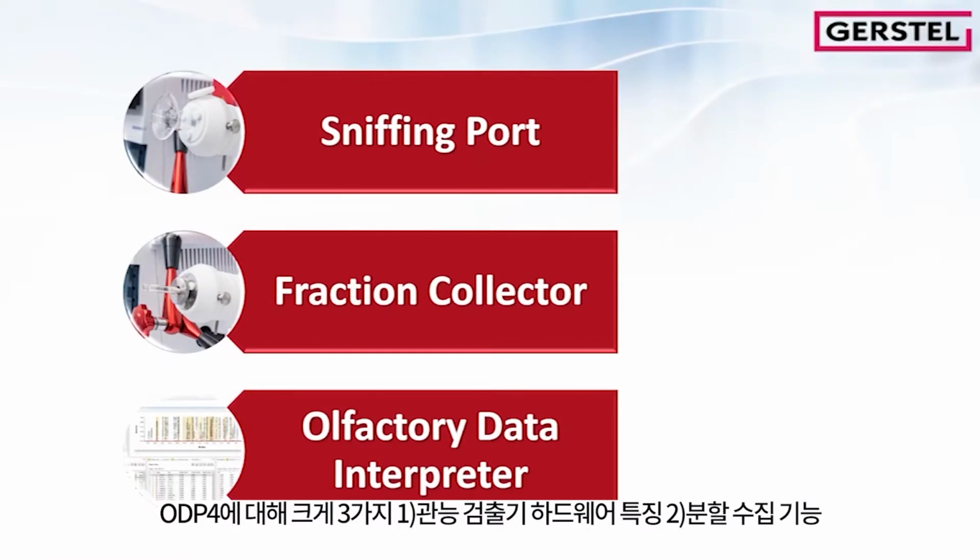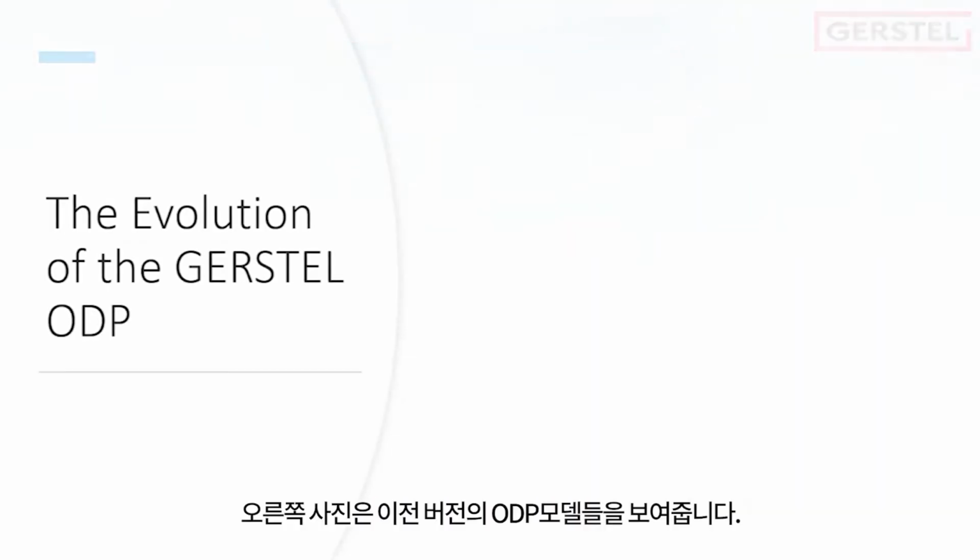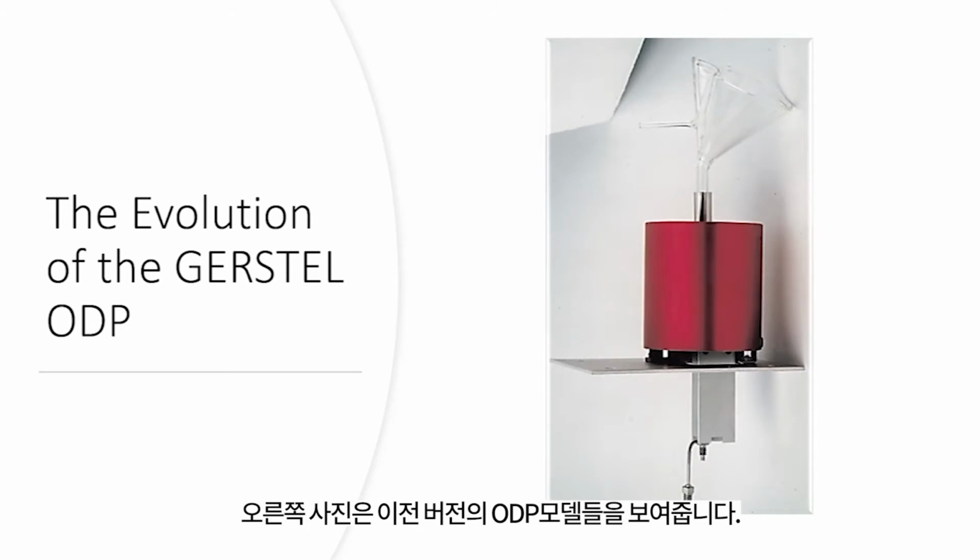We have divided this video in 3 sections: the sniffing port hardware, the fraction collector configuration, and the olfactory data interpreter software. Here we show you the 3 versions from the past.